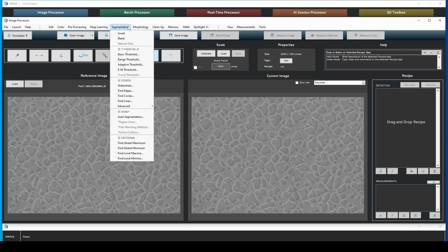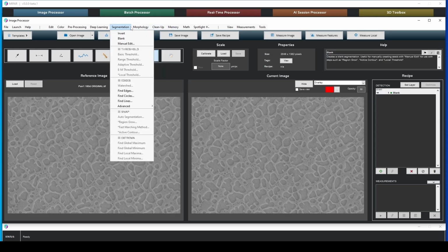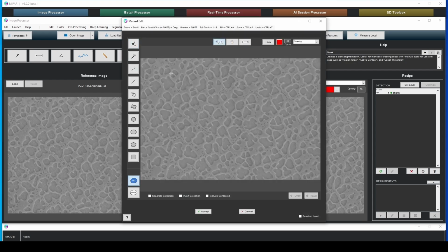So, real quick, Spotlight powers Snap, and the way to activate Snap is to go into our manual edit toolbox. In our redesigned UI, it is located at the top. There are a couple different modes we can select: our fast accurate slider, point or box method, and then our feature scale. These were explained in the previous videos covering Spotlight, and we most likely want to use accurate.